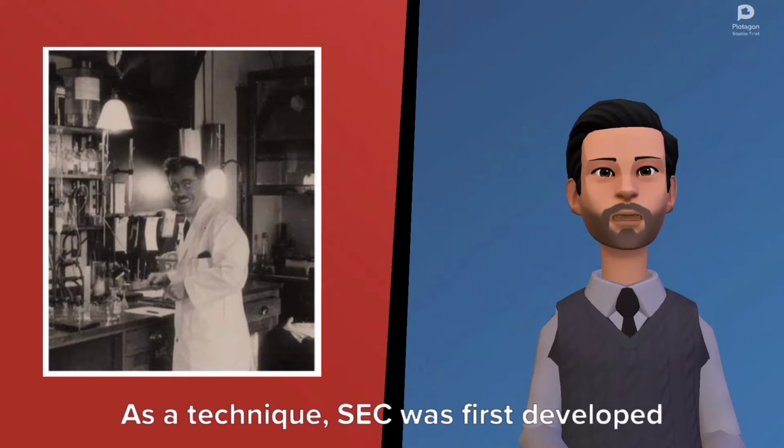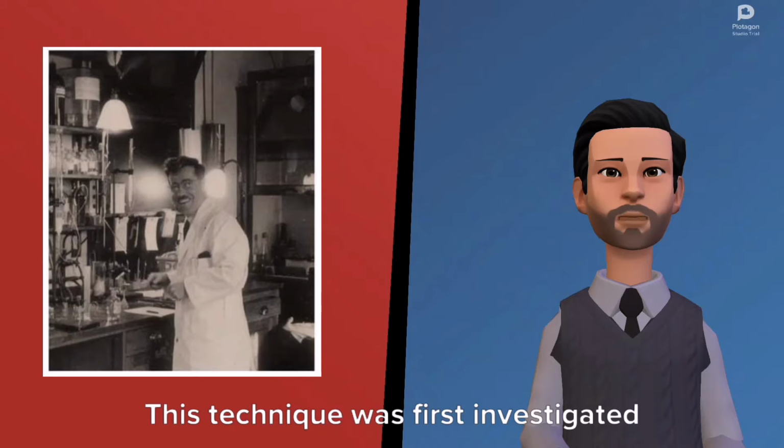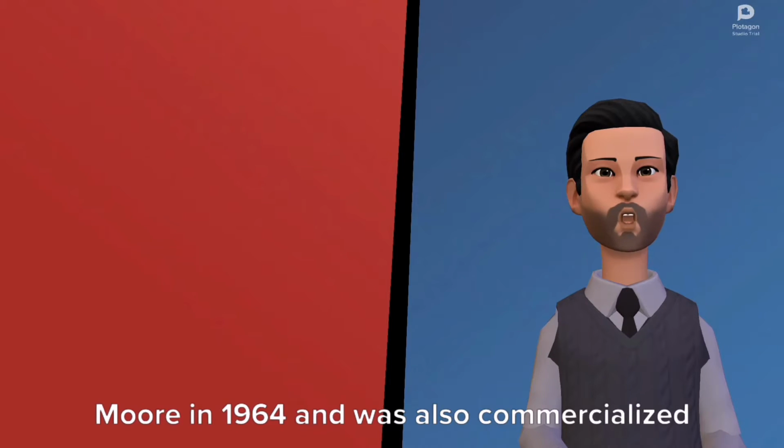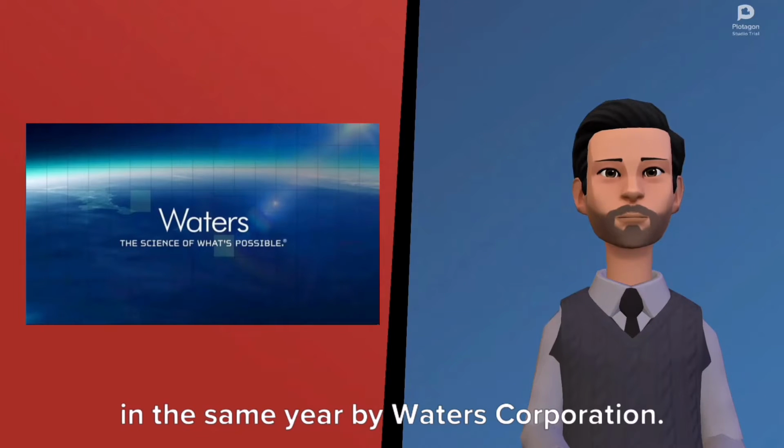As a technique, SEC was first developed in 1955 by Lathe and Ruthven. This technique was first investigated by J.C. Moore in 1964 and was also commercialized in the same year by Waters Corporation.